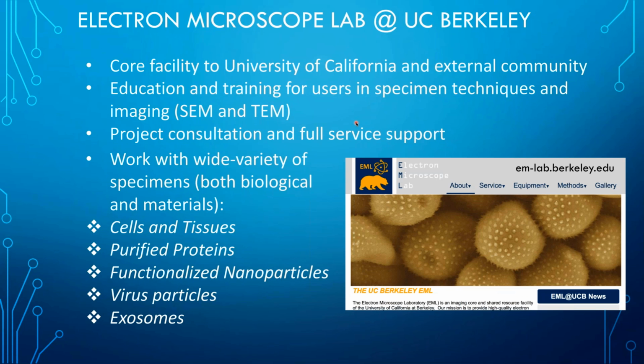One of our specialist techniques is high pressure freezing freeze substitution, and we apply all of our techniques to a huge variety of biological materials and also more hard chemical and materials analyses as well. So we see a whole breadth of things, including cells and tissues, purified proteins, nanoparticles, viruses, exosomes, you name it, we work on it. So it's a really exciting place to work and to get to explore various parts of science.